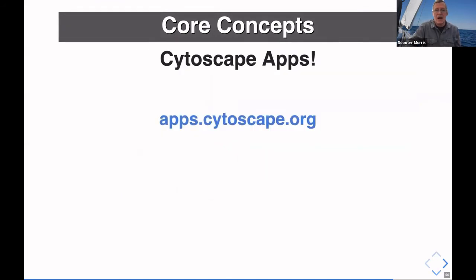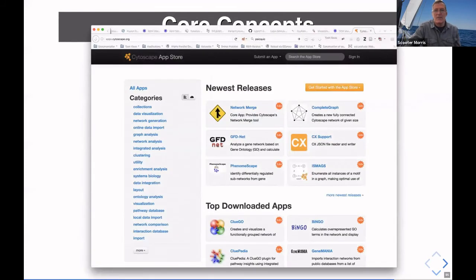And leading right into apps. So there's an app store for Cytoscape. I don't like the name App Store. I debated against the name App Store and I lost that debate. We don't sell anything, and so it's not really a store. It's an app repository.